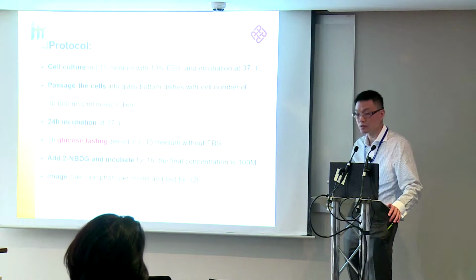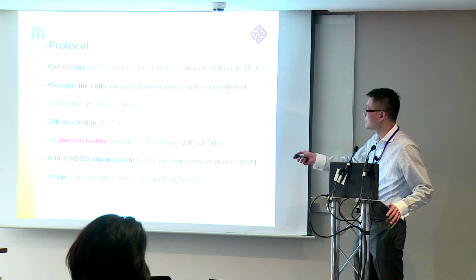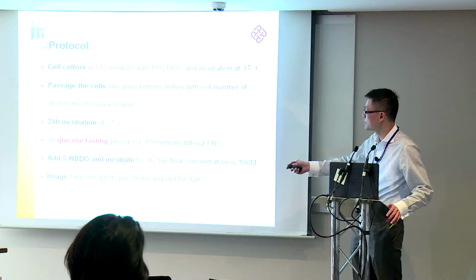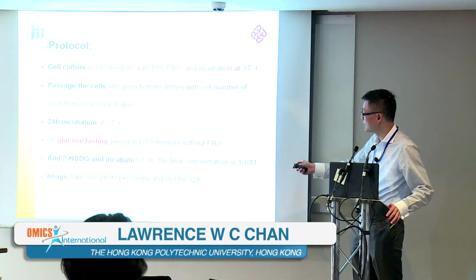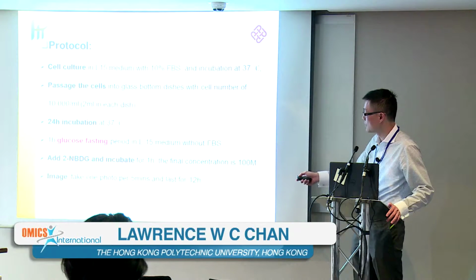This is the protocol. We perform our cell culture in L15 medium at a set temperature, along with the other steps, and incubate for 24 hours.